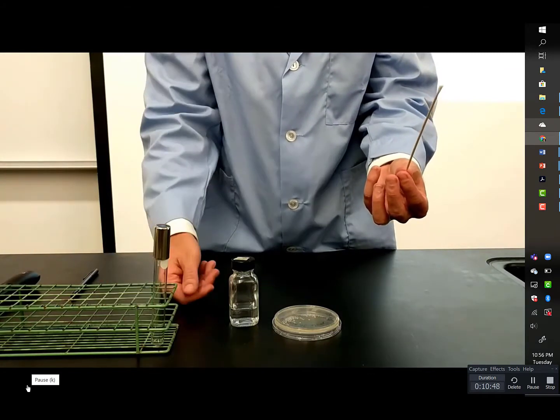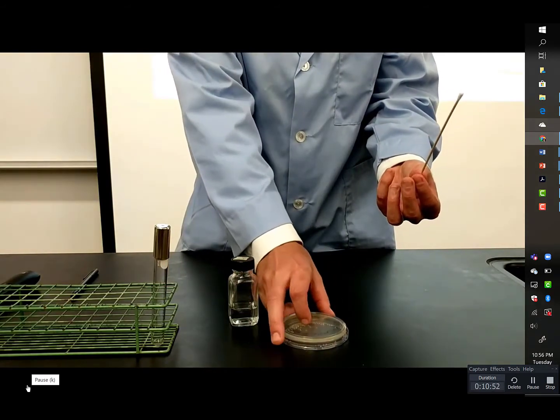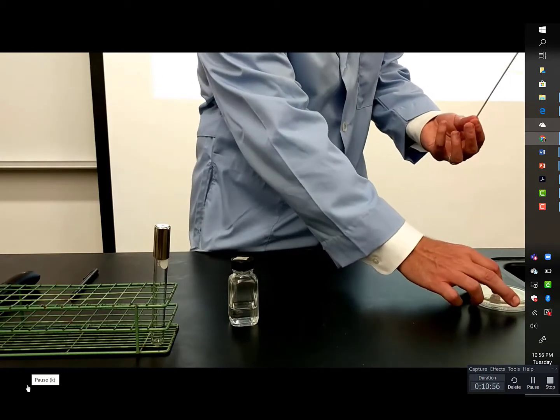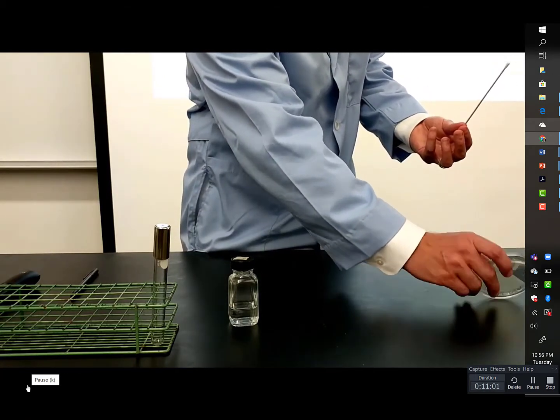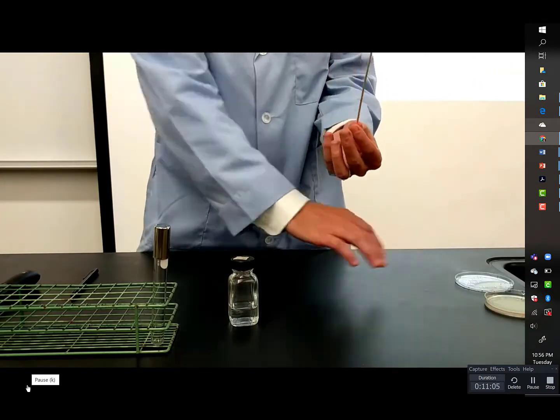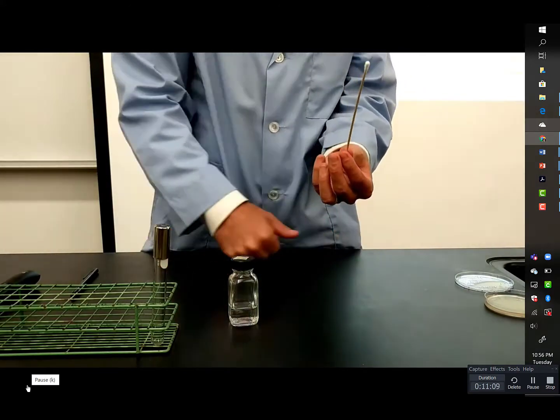Now, I just realized that this was my air sample. All right, I'm going to go ahead and set this aside. I think I'll put this over here, and we'll let this stay open for 20 minutes, okay? And so that's the 20-minute air sample, and I just looked at the clock, and I'll have to collect that in just a little bit.